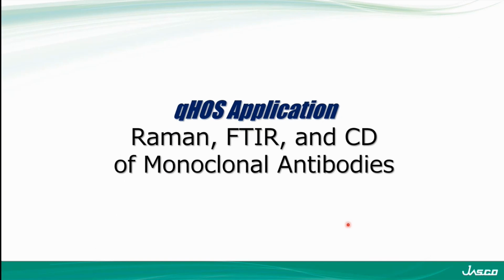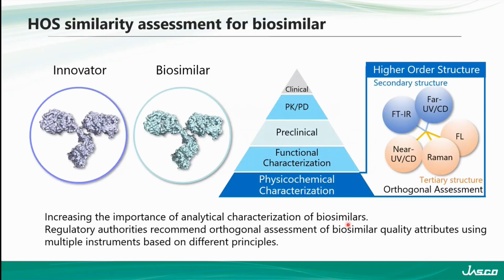And so now that we've got a handle of how this software is operating, what it looks like to actually use it, and then why we've developed it the way we have, we're going to dive into an application using the software. And like we previously mentioned, we're going to use Raman, FTIR, and CD, and then we're going to return back to the monoclonal antibodies now.